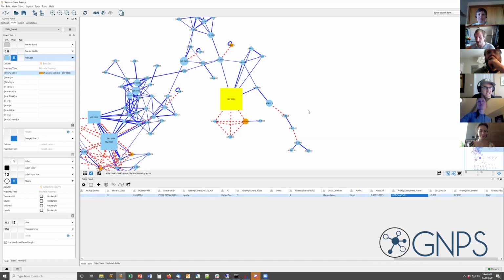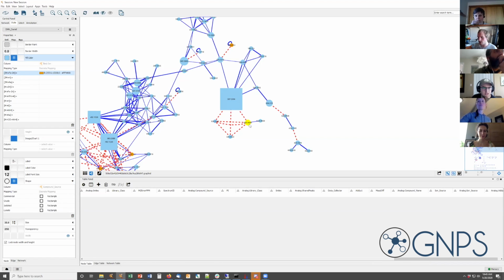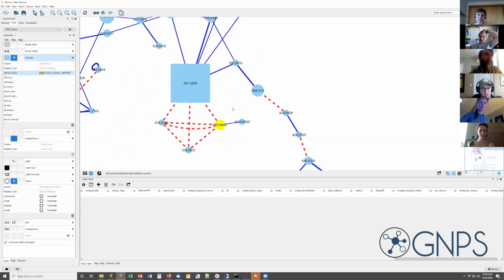So yeah, in this example, the M plus iron here actually has kind of a double. What that could mean is that I may use two of the truncated products to actually complex iron. So that's a wild hypothesis. It would be interesting now to look at the structure of it. What's the name again? HC something. You're saying this because the difference in the edge annotation is 2M plus iron. Yeah, exactly. Oh, okay.